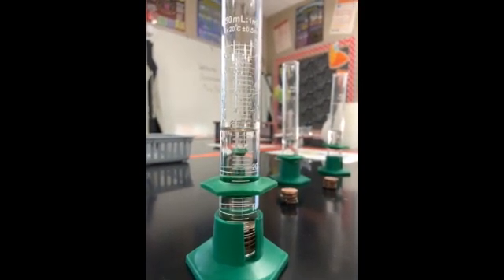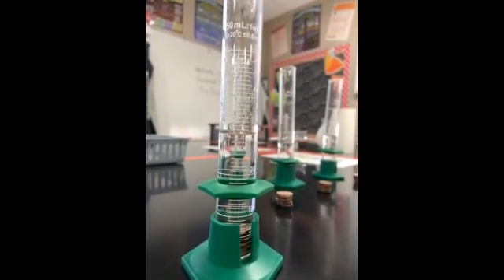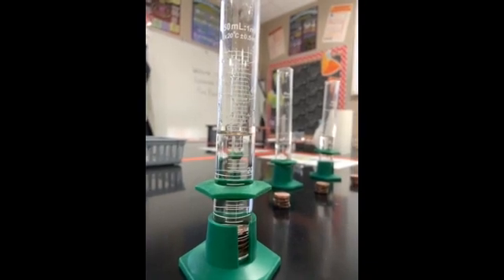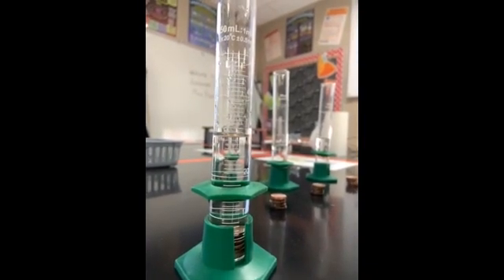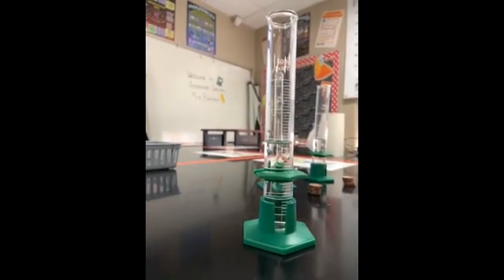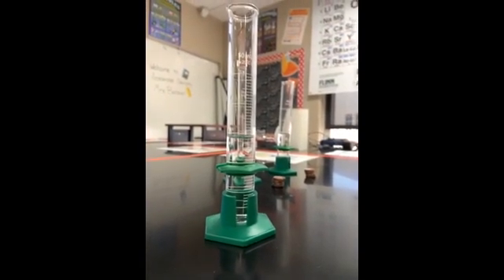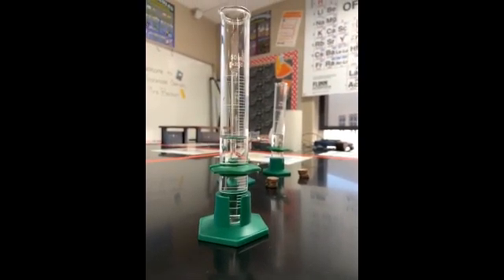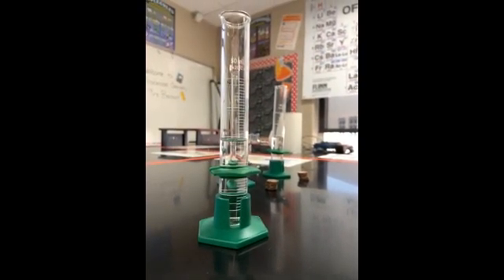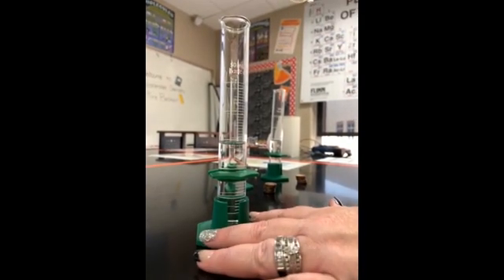So now, now that I've put in the pennies, post 82, trial 1, pennies plus water, looks like 30.01. It's just above that 30 mark. So 30.01. Remove that. Trial 2, post 82, water, looks like 28.9. 28.9. Yep, 28.9.